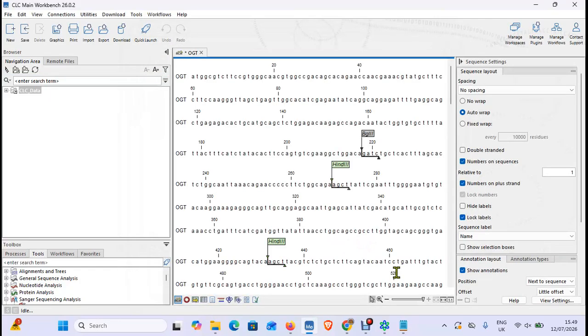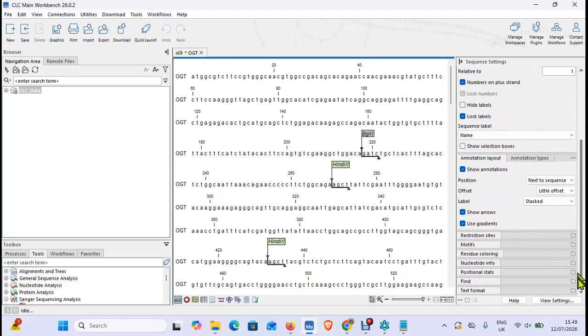The software takes a second, and it immediately checks for the most popular restriction sites. Here is where things get real: many cloners have restriction enzymes that they are fond of. I am no exception to that rule. I love BamHI and I love NotI, front and back, plain and simple. If I can get away with it, I will do it.